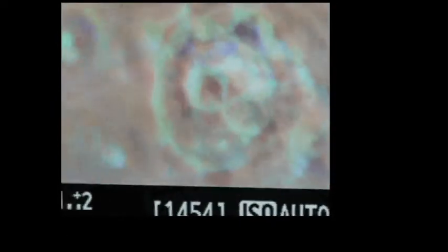It's hard to tell what kind of bacteria this is because we haven't been able to identify it, but it went up to the 11 o'clock position and you can see it now penetrating out through the cell wall. It actually increased its size by tenfold.